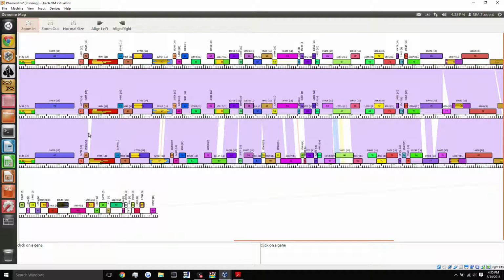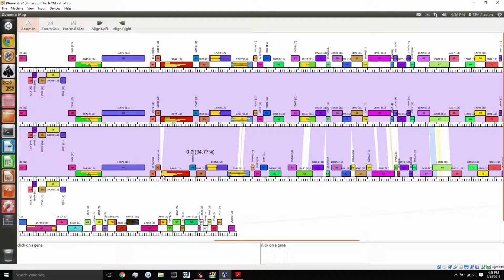And pretty much what that means is no sequence or no nucleotide similarity whatsoever between these regions. So we'll see, say, for this break here, we'll zoom in on it a little bit. There's a slight difference from these two. So this is Convoy and Humpty Dumpty, I believe.